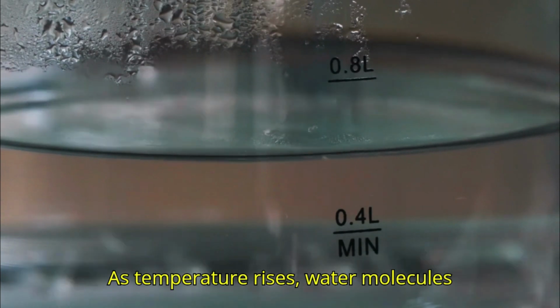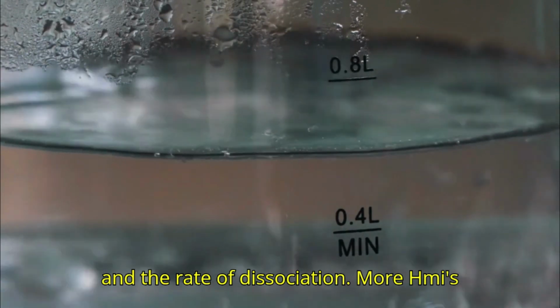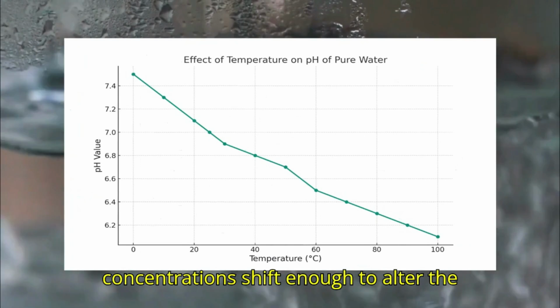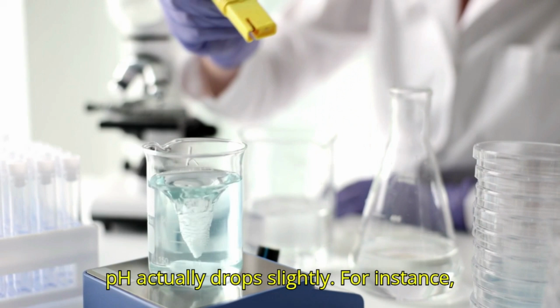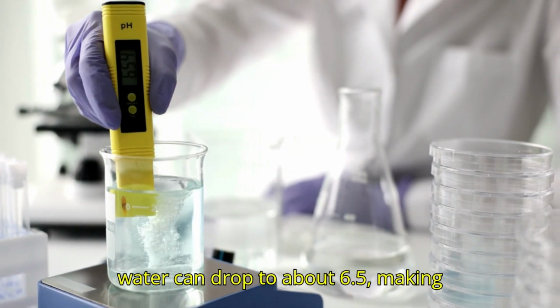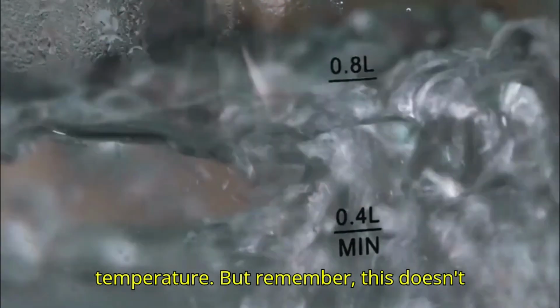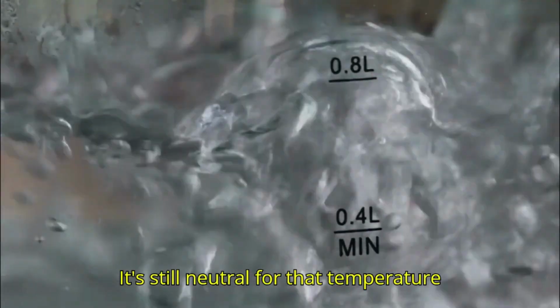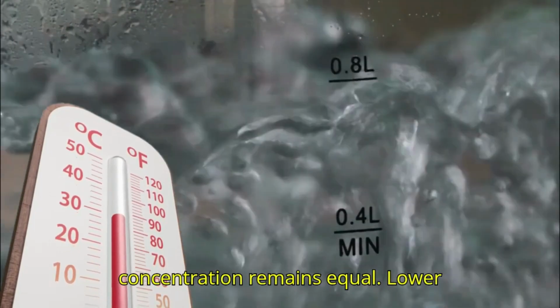As temperature rises, water molecules gain more energy, increasing their motion and the rate of dissociation. More H+ and OH- ions are created, but their concentrations shift enough to alter the pH. As temperature goes up, water's pH actually drops slightly. For instance, at 60 degrees Celsius, the pH of pure water can drop to about 6.5, making it technically more acidic than at room temperature. But remember, this doesn't mean water becomes harmful or corrosive. It's still neutral for that temperature because the H+ and OH- ion concentration remains equal.